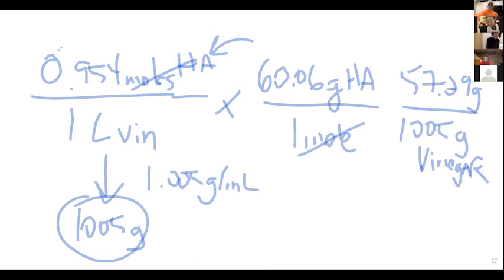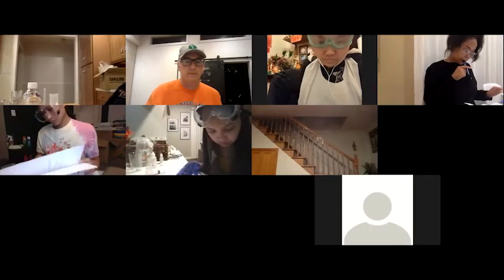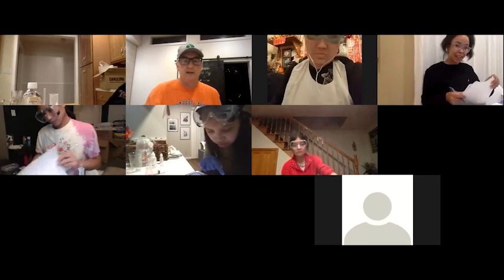Yeah. So you got around 5.7%. Mhm. So, you know, that's not bad. It's a little high, but remember, that's why we do things in triplicate. Where are we reporting the mass percent? I believe that is in table 1. Oh, table 1 has two pages. Okay. Yeah, it's a big table.